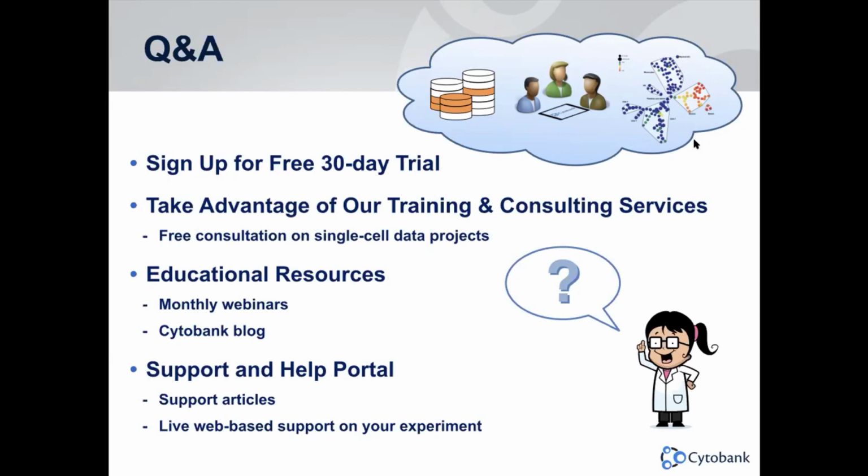Yeah, this seems to be for Cytobank. I will be happy to take that question. There are a few extra steps if you are trying to identify the Citrus clusters on your viSNE plot. First you will need to run viSNE on the data you're trying to analyze for finding the different biomarkers.